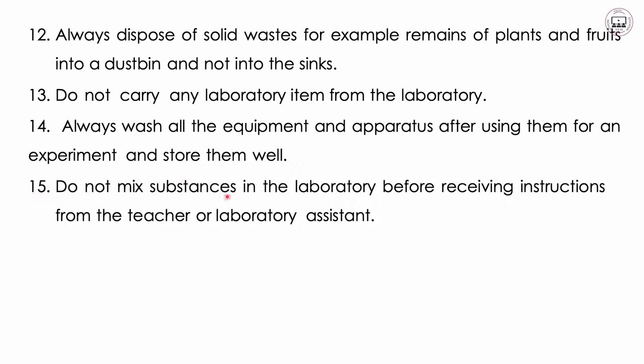15, do not mix substances in the laboratory before receiving instructions from the teacher or laboratory assistant. I have already said, some chemicals, some metals, if mixed in the laboratory, cause explosions. They may cause different kinds of reactions.